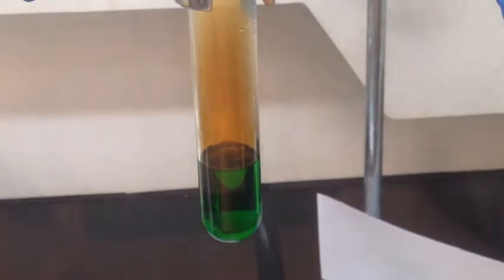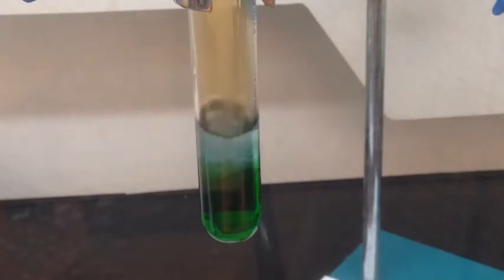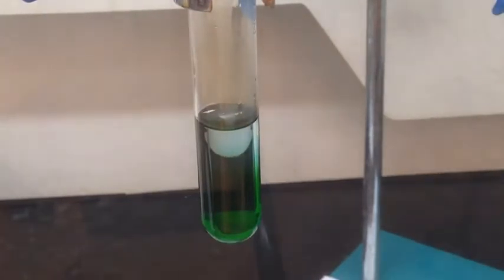And how can we obtain a very traditional blue color of copper 2 ion? Simply we can add water into it. Firstly, adding water is to dissolve those nitrogen dioxide. We can remove the nitrogen dioxide by adding a little bit more water, or displacing it, because nitrogen dioxide itself is highly dense. So we add water, then we're pushing those nitrogen dioxide gas away. So you notice after adding some water, those brown gas disappeared.